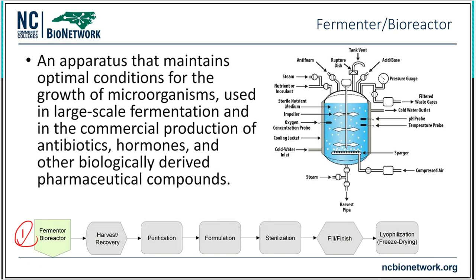Look, it's not surprising. It looks like I've got some intakes. Look, nutrients. So I've got a little place where I can add some nutrients, and then all of the things on the inside here go yum, yum, yum. And they just continue to make babies, and they continue to grow, and they continue to get big. And then we see them off to college, and we wave our hands and go, bye, don't come back for a while, see ya. Okay, well, there's some nutrients that are going into the vat.